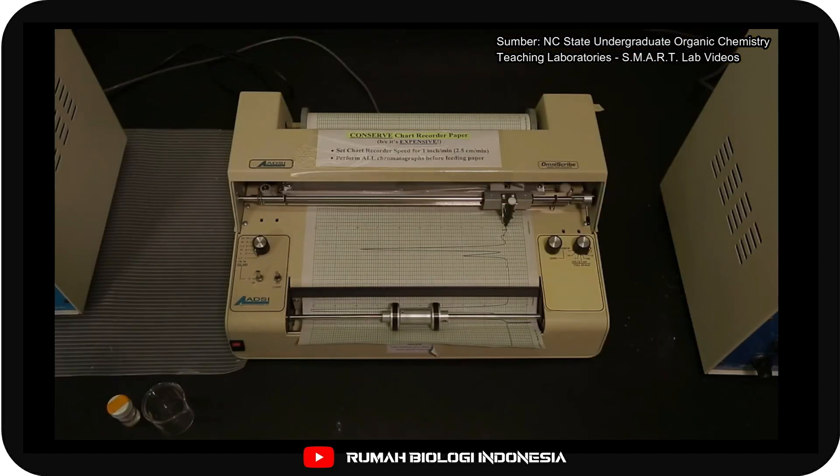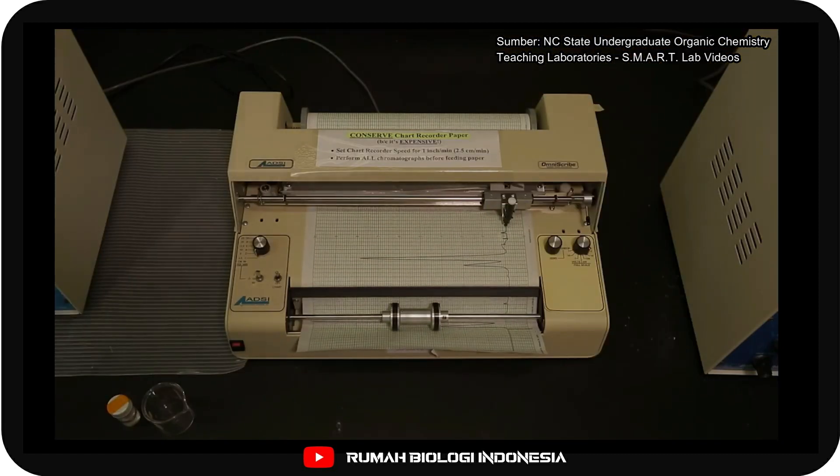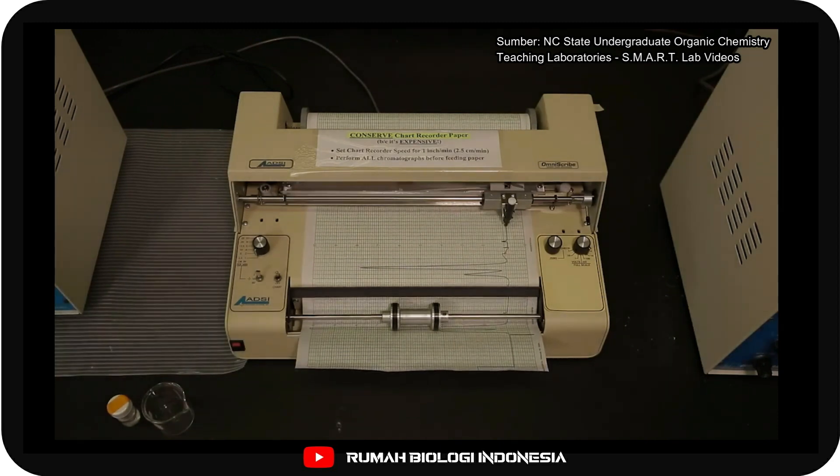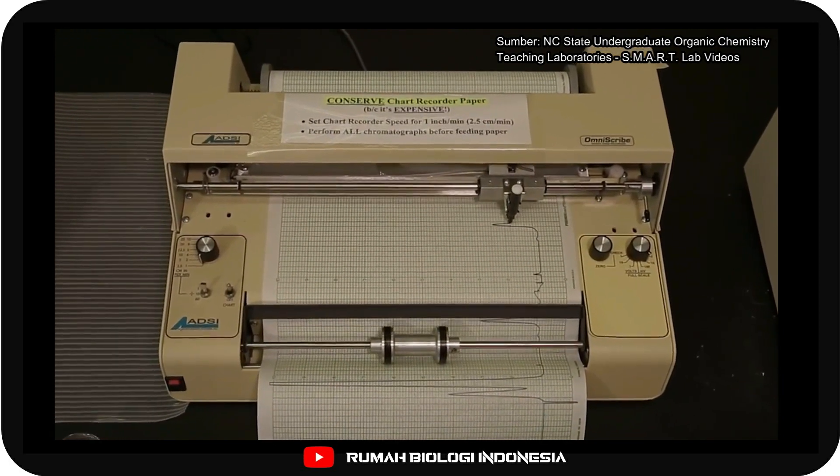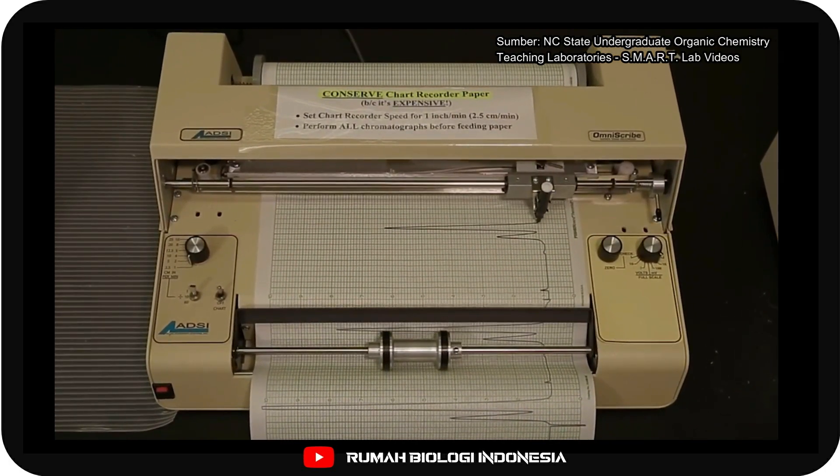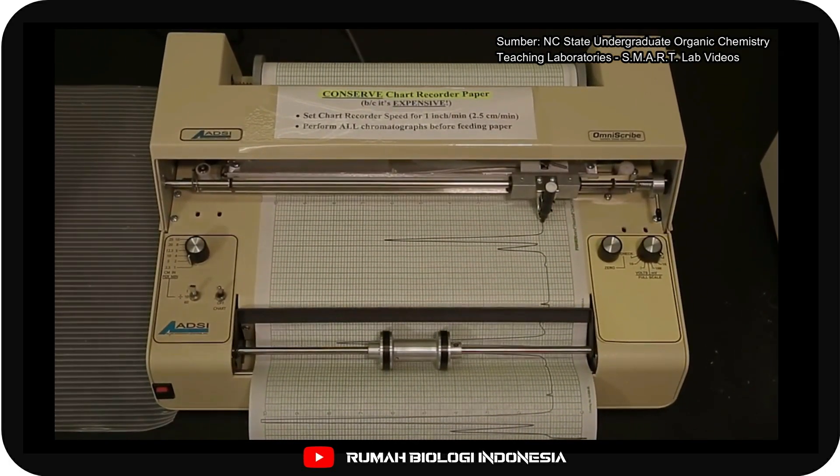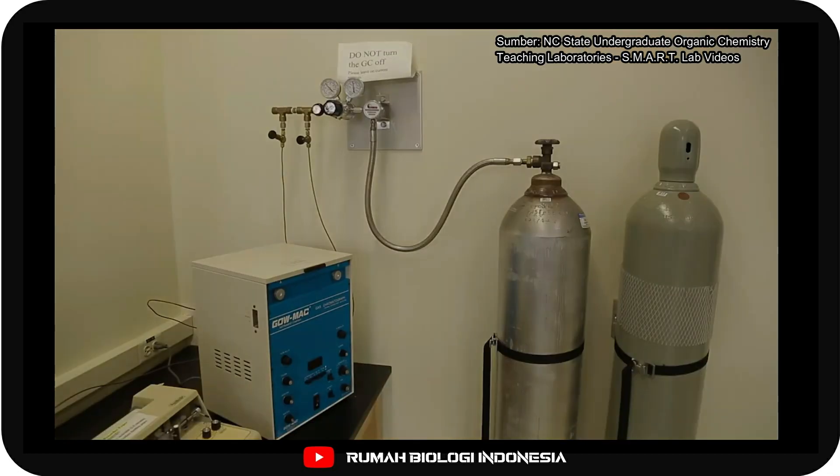The helium is the carrier for your sample. This technique allows us to separate volatile organic compounds based on their physical properties and determine relative amounts of product yields. Coupled with a computer library, GC can also be used to identify organic compounds.